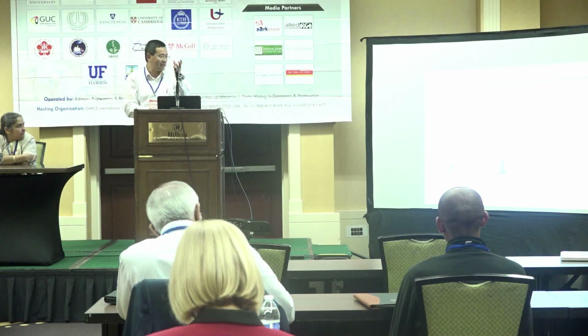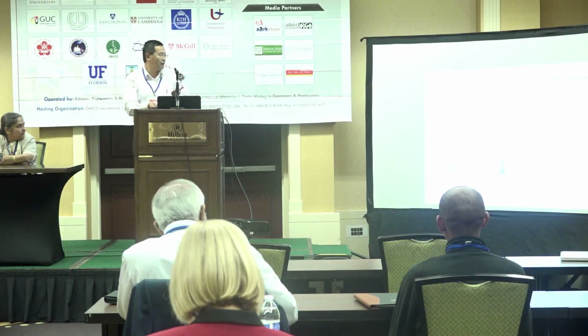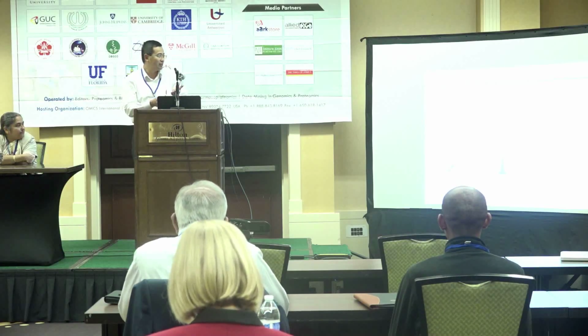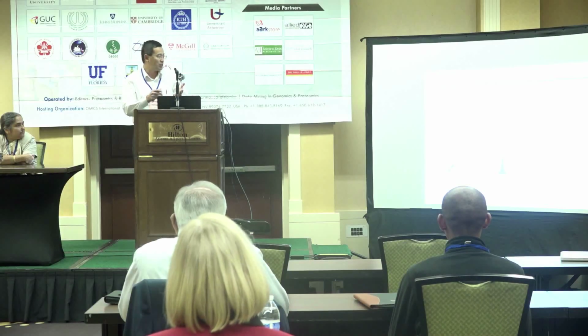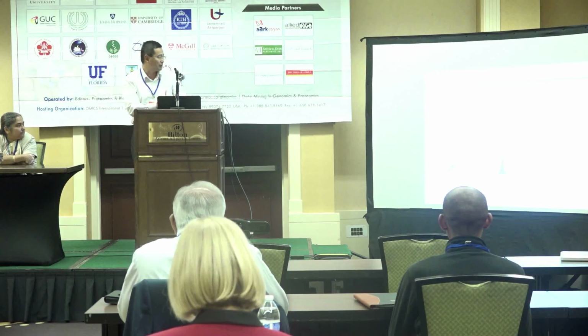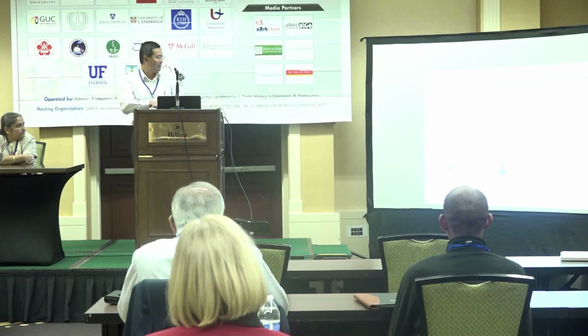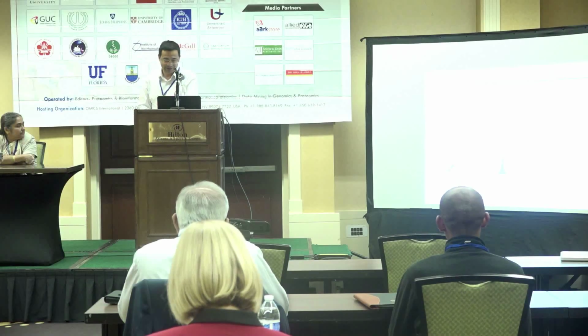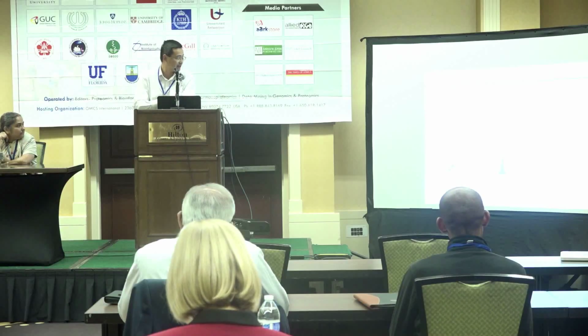Yes, maybe, but you cannot overlook protein turnover and degradation. Degradation is another side, which can change protein levels. So people have developed isotope labeling using SILAC to monitor protein degradation and turnover in yeast cells and also in plant cells.